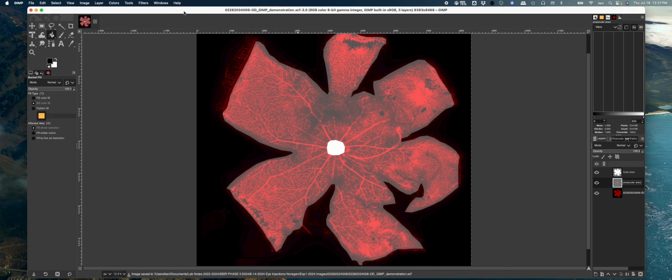And there you go. I think GIMP is a better tool, easier to use than Photoshop to do this work, tracing the areas. The nice thing too is that GIMP is free. You can install it on any of your Windows machines or any of your Macs. And they even have versions of GIMP that go back. They keep them archived, so you can even have a much older version of your operating system and still get this program. These basic tools all work going back years in this program.